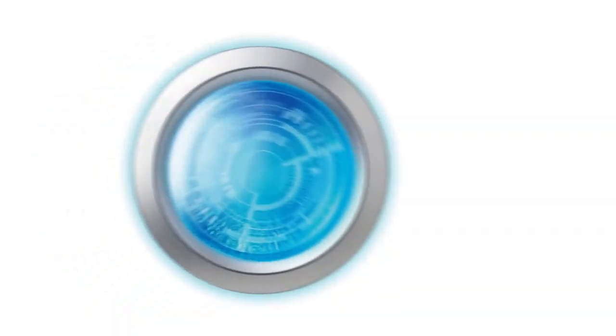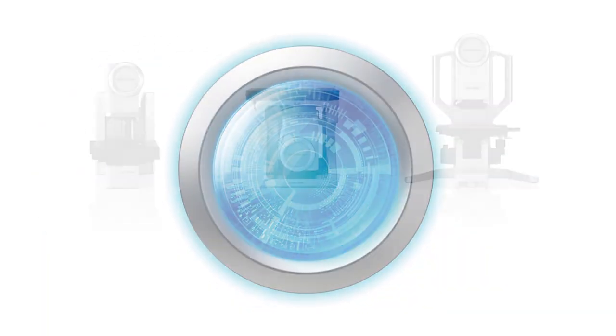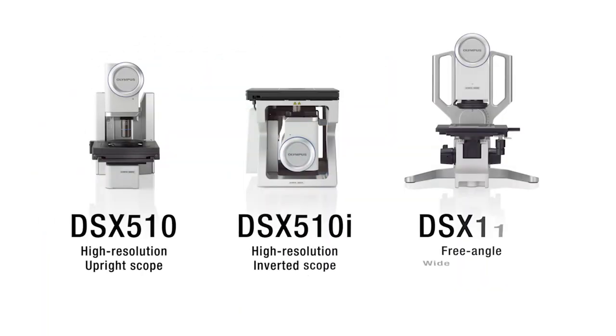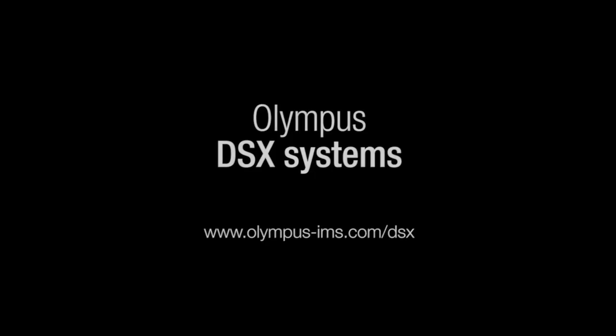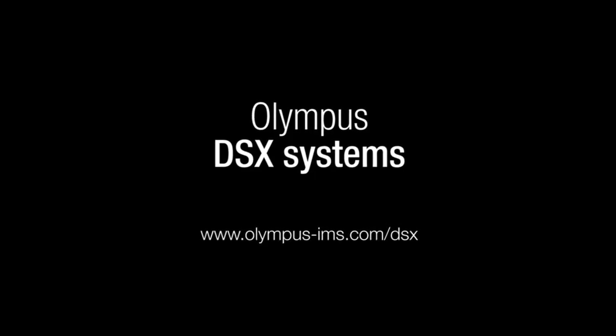DSX. Innovation at your fingertips. Only with Olympus DSX digital systems. Olympus DSX.